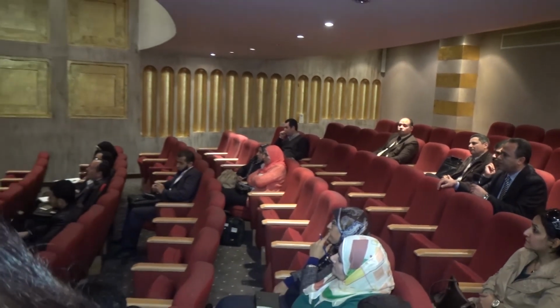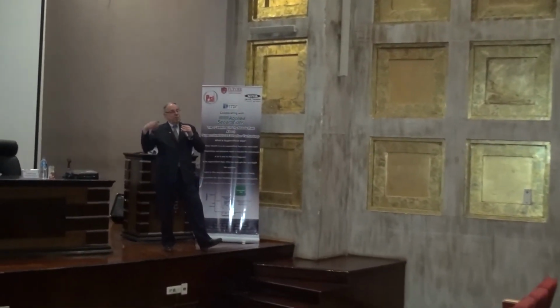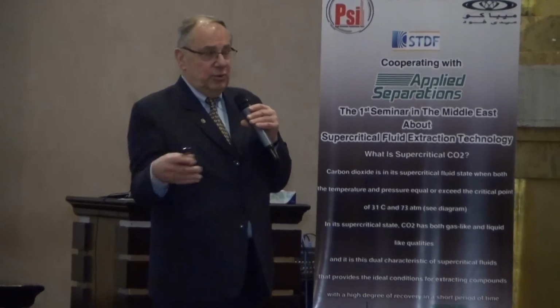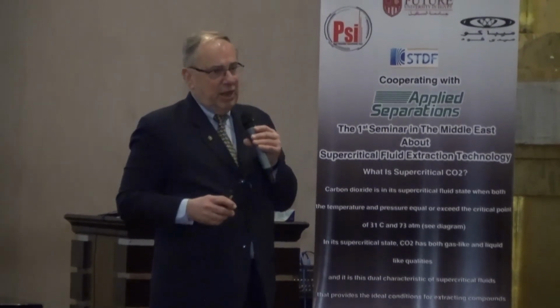I'll be very frank with you. There have not been good results when we're dealing with organic molecules for pharmaceuticals. The results have not been that good. And the problems that you have most of the time have to do with agglomeration. That is, the very small particles will stick together. Now, people are trying all sorts of techniques subsequent to making the particles, for example, putting ultrasound into the collection area. So there is work being done in this area to prevent this kind of agglomeration.